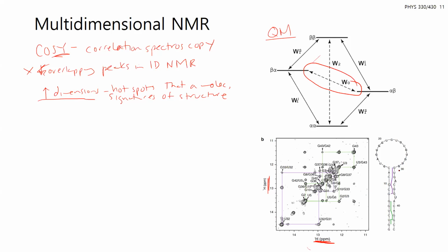And this can correspond to that spin transfer of nucleotides, residues from one another, that you can see here. They're able to actually label these with specific protons on either side of this RNA aptamer. So this is what the type of data looks like here.